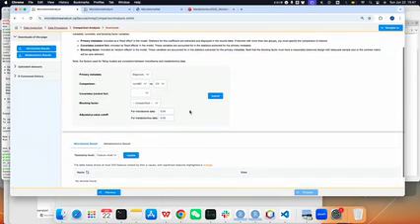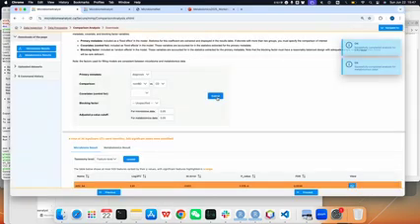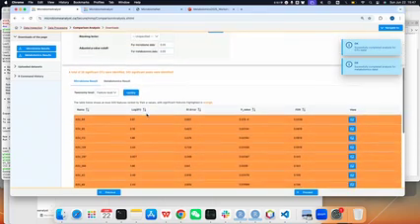By default we didn't specify the method here, because we use a linear model like LIMMA for the metabolomics data, and MaAsLin2 for the microbiome data, which are multivariate. We have more choices, and the result is usually better.